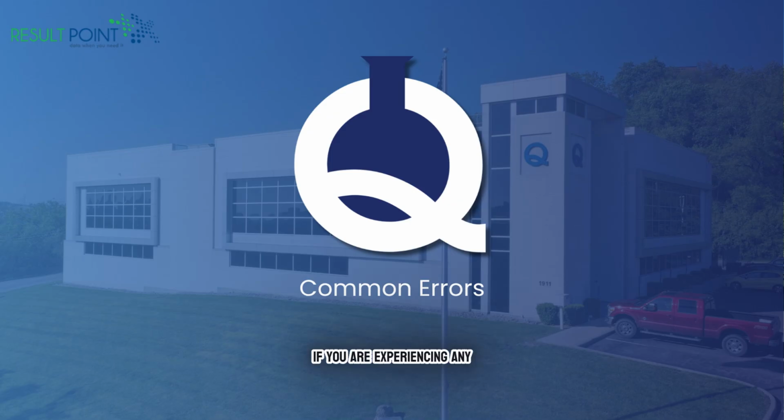If you are experiencing any errors that you don't see in this section, please contact ResultPoint at qlaboratories.com with a screenshot or description of the error, and we'll get back to you as soon as possible.